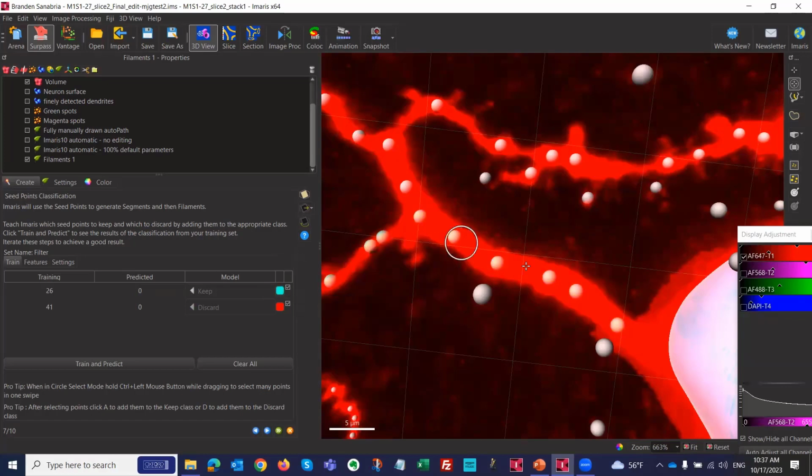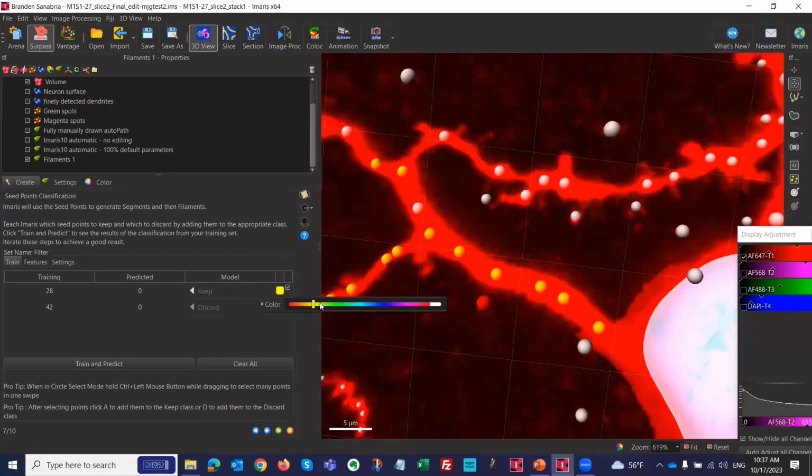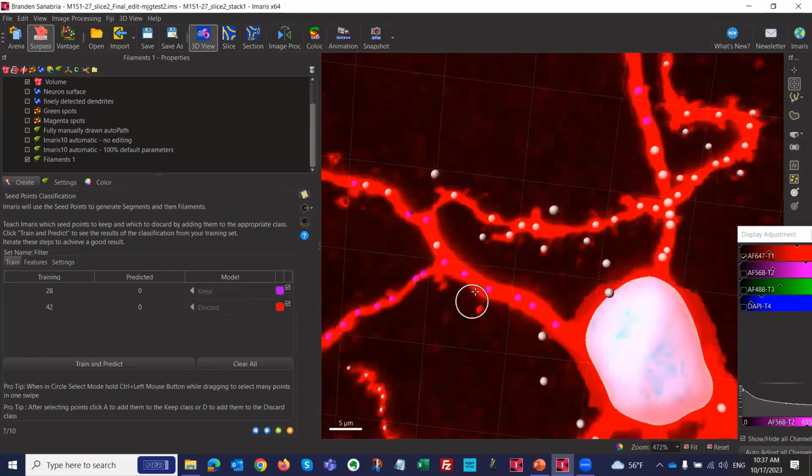So you didn't actually notice. Here, I mean, red. Yes, it's clear. But yeah, you can always change the color to something that you can see better, for sure. And then they stay that way. So now I just did yellow, and then I take those guys here and keep them yellowish. Or if you don't like yellow, you can also use purple or something like this.